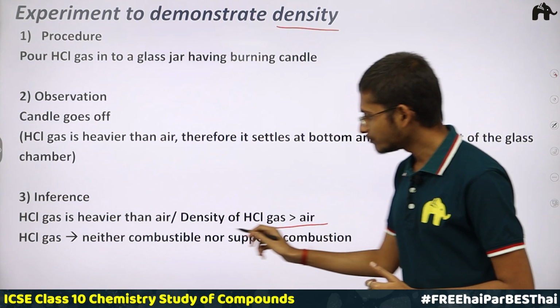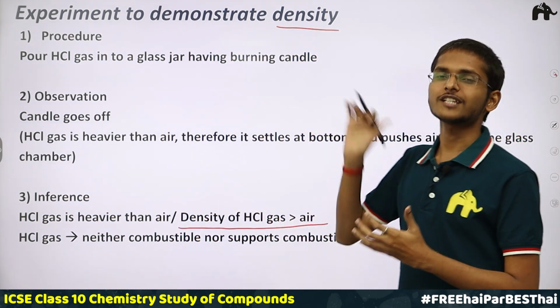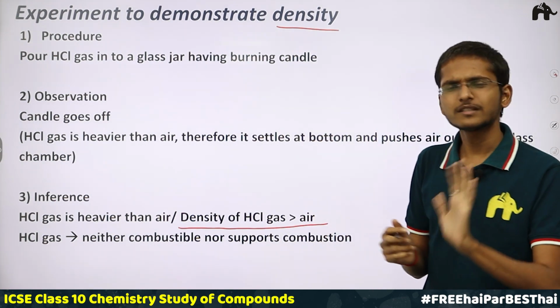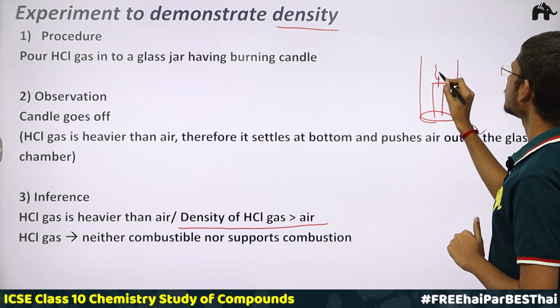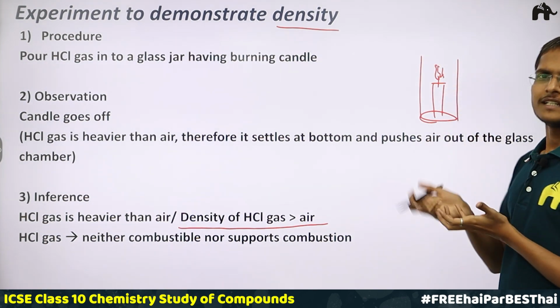Okay, so we are going to prove this thing with the help of an experiment, and we are going to study this experiment. How do we come to know that the density of HCl gas is more than air? What we are going to do is very simple: we are going to take a glass jar, and then I'm going to light a candle in it, just like you maybe would be lighting for birthdays and all those things.